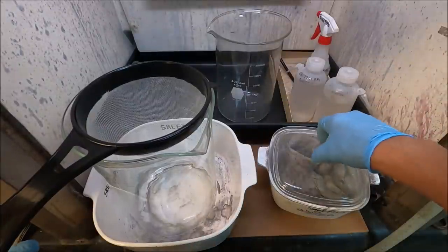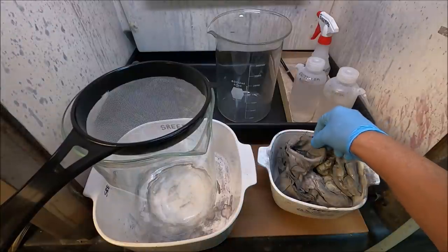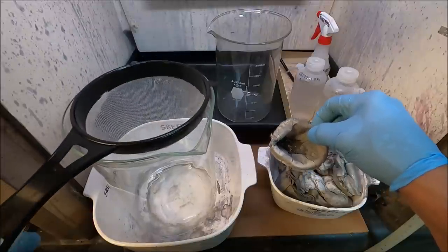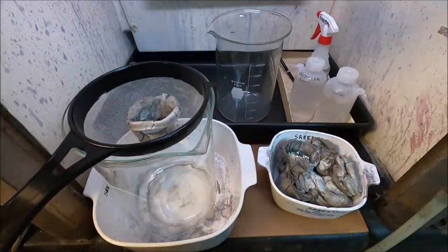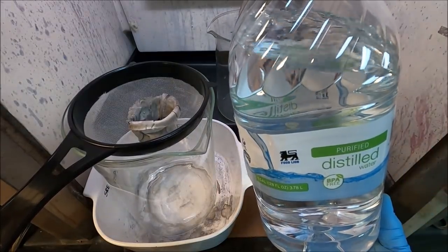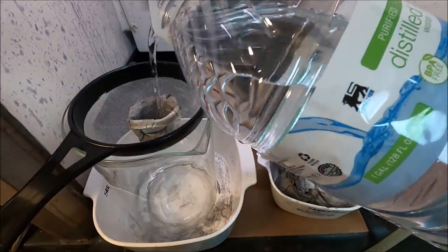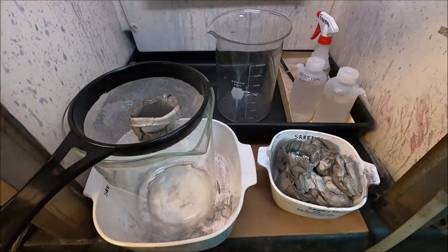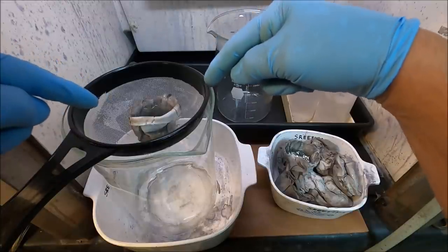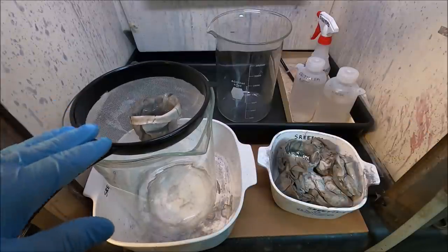We're going to begin by taking one of our filters here. These things are hard as a rock, completely dry. I've got a nylon screen here that I bought at Walmart. I'm just going to set that in there and we're going to douse it with some distilled water to get it softened up. Then I'm going to get that black powdered material out of here and try to catch any residual pieces of silver shot in this screen.